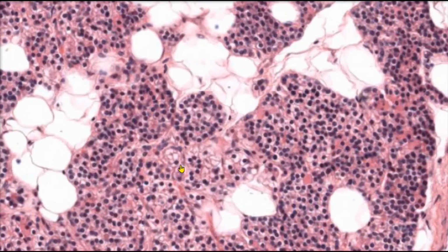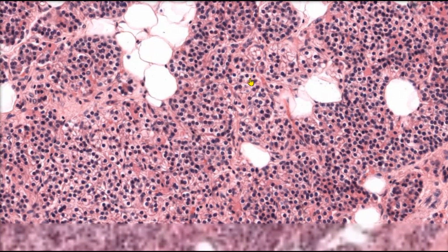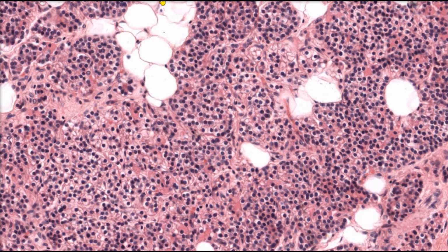So as we zoom in, notice how we don't see any of those follicles that we saw on our thyroid gland. We do have some adipose tissue here, but the cells form these really dense masses. Now, the parathyroid gland is responsible for producing a hormone called parathyroid hormone. Parathyroid hormone is the most important regulator of calcium in humans.